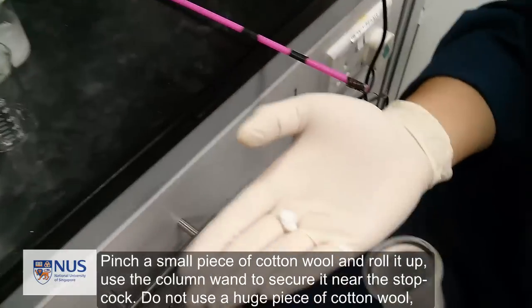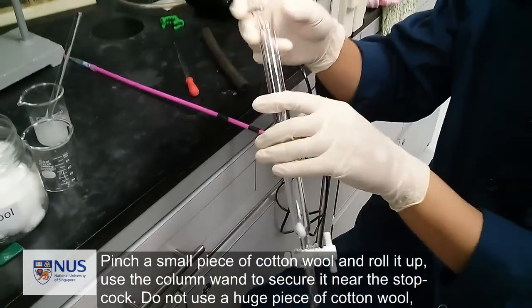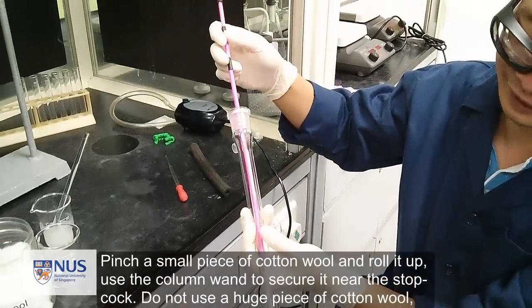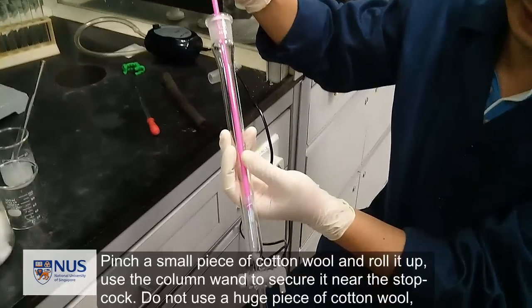Now show time. Pinch a small piece of cotton wool and roll it up, and use the column funnel to secure it near the stopcock. Do not use a huge piece of cotton wool.